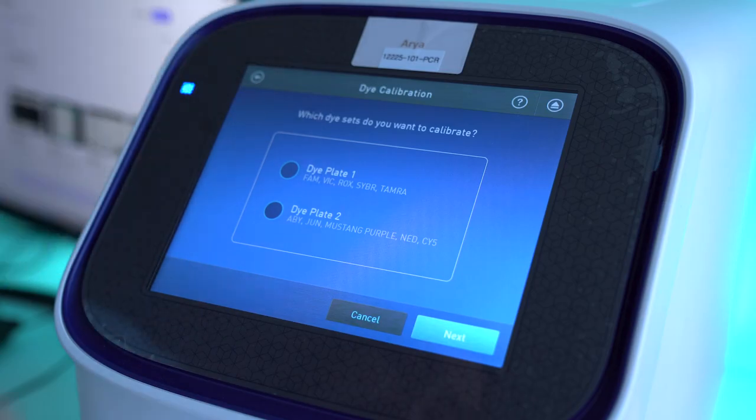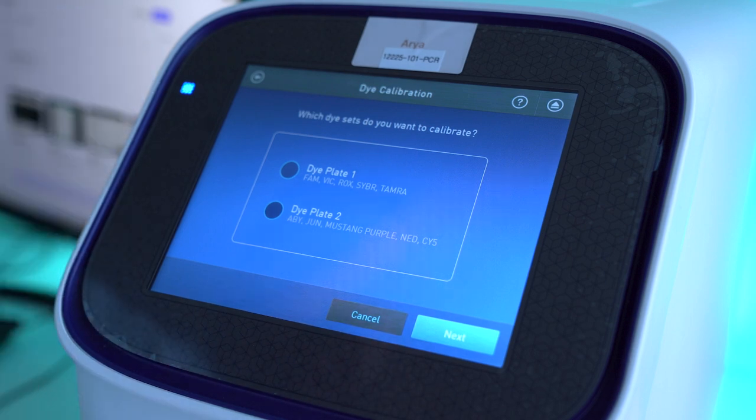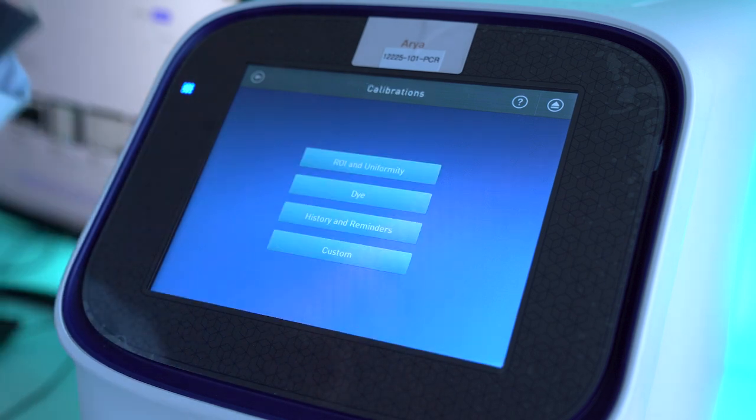You would select the plate, hit Next, put in your plates, and then the machine will automatically calibrate.